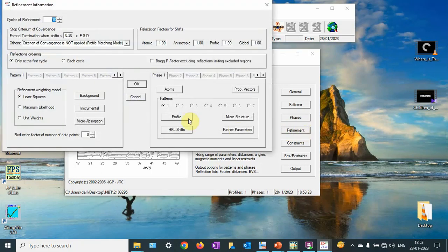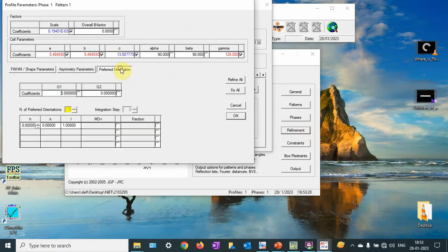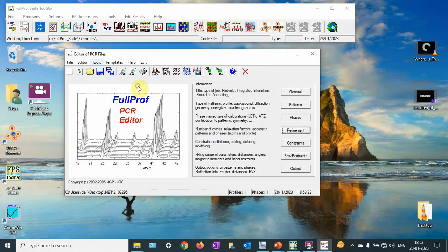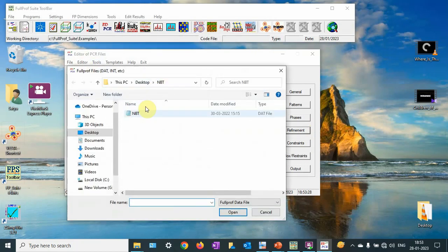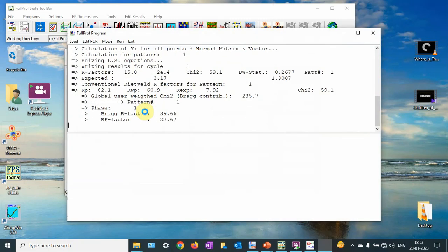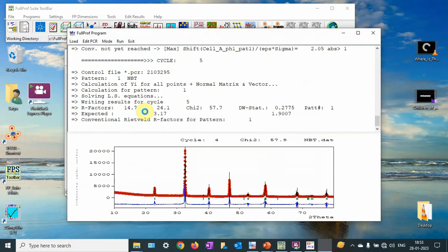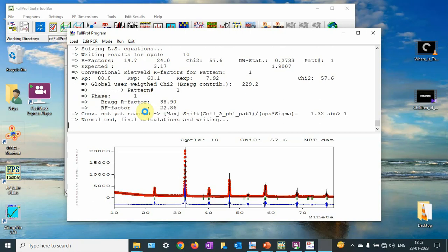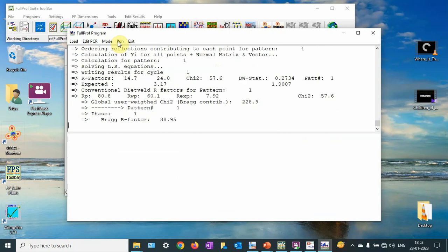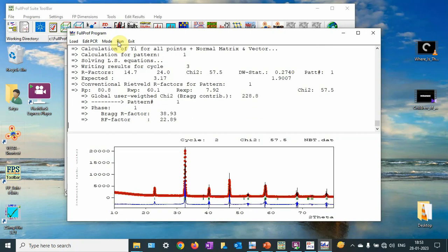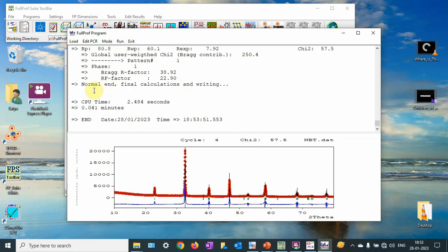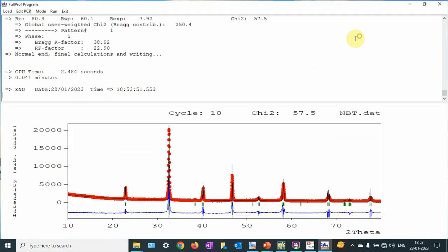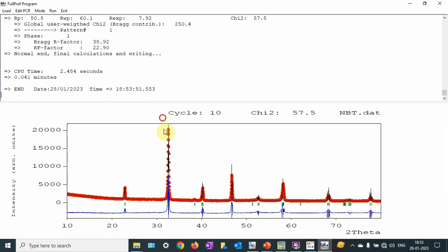Now I am going to refine the preferred orientations. Let me run it. It is getting converged. Normal end — the chi-square is coming good.